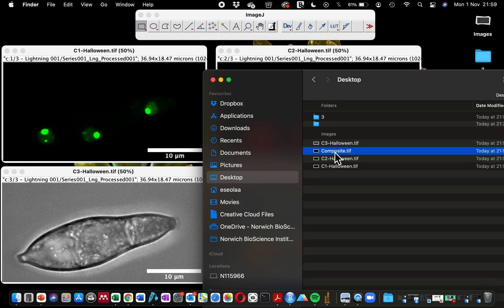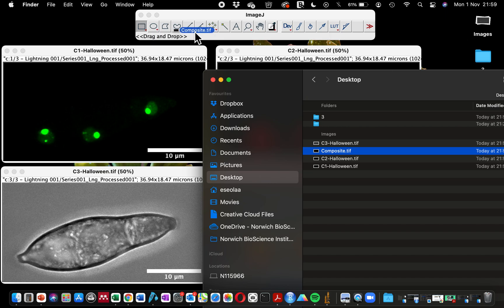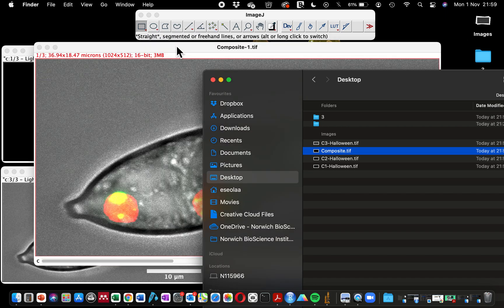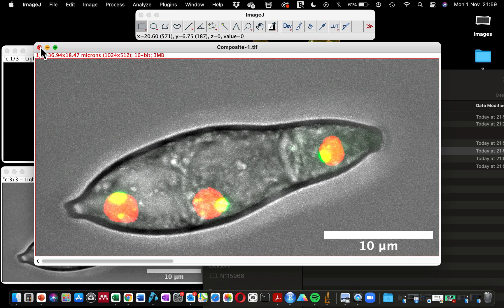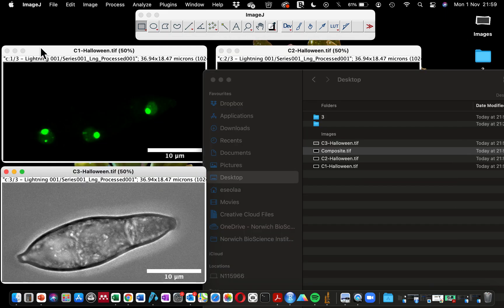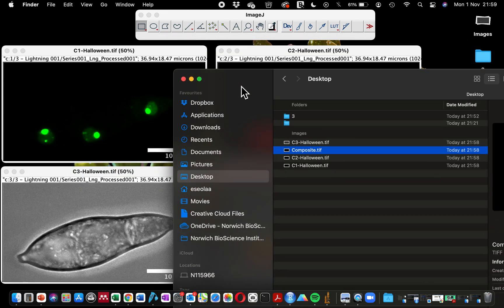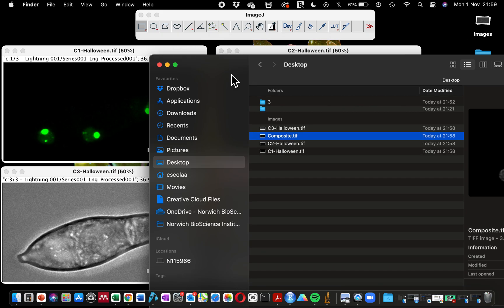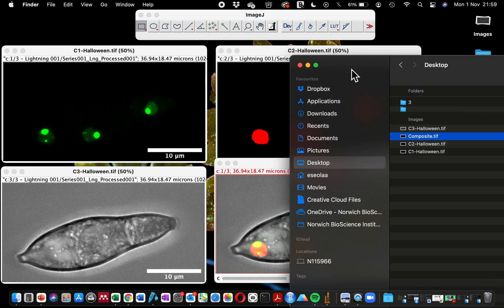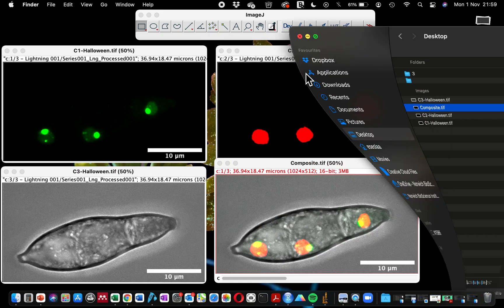Interestingly, when I drag this to ImageJ, you can see that ImageJ is able to display the whole information. So why is ImageJ doing this to us? When this happened to me, I knew that I needed to find a solution.